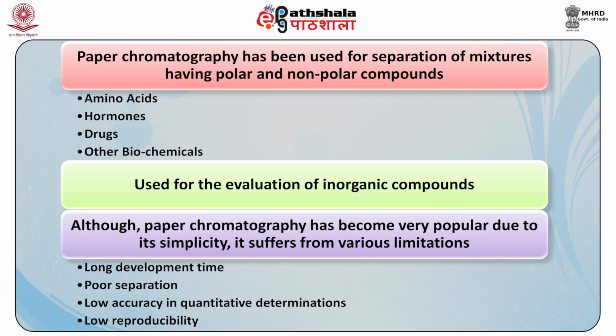Although paper chromatography has become very popular due to its simplicity, it suffers from various limitations such as long development time, poor separation, low accuracy in quantitative determination and low reproducibility.